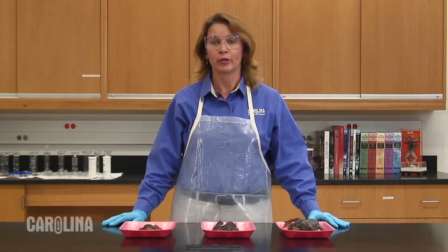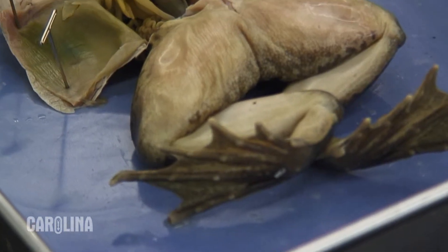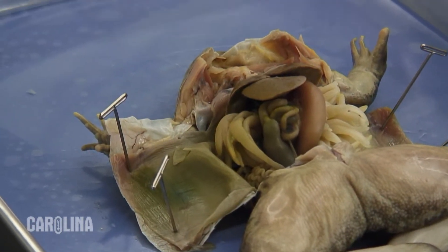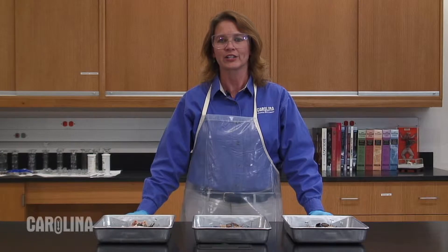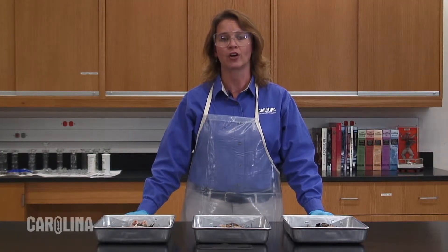You'll also need to determine how in-depth your anatomical studies will be. For younger or beginner level students, plain specimens with no color injections are ideal. Students will learn basic structures and functions while practicing proper dissection techniques. If you are planning a more involved dissection that includes the arterial, venal, or hepatic systems, we suggest using injected frogs.